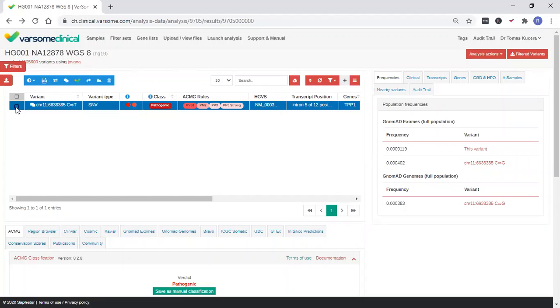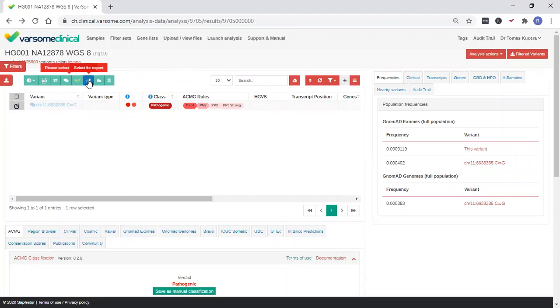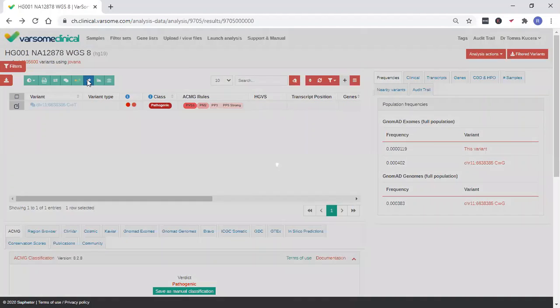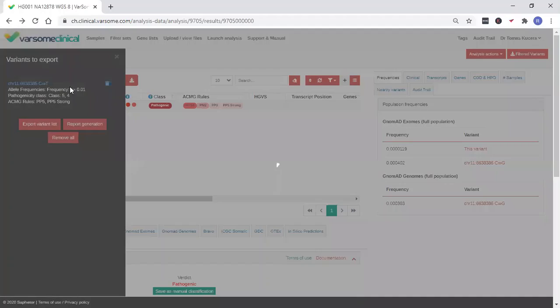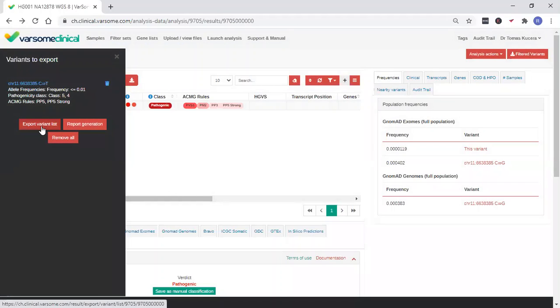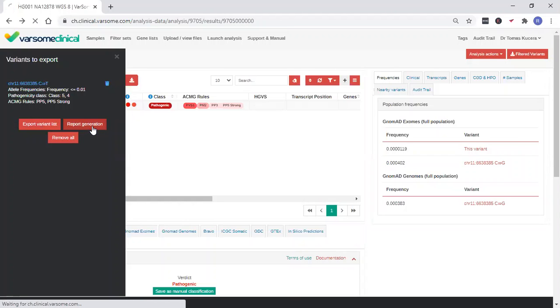To report a variant, select it here and use the arrow icon. You'll be able to export this variant as an Excel file or you can proceed directly to clinical report generation.